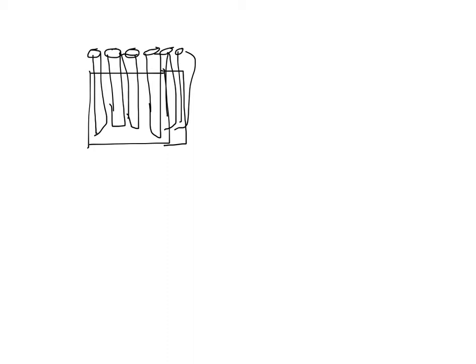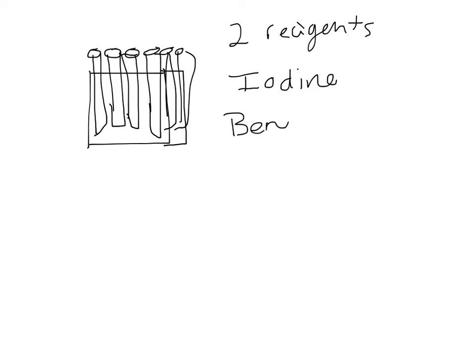You're going to be given 2 reagents, and you should be very familiar with these reagents right now. We're going to be using iodine and Benedict's. Okay, and think of these as pairs.